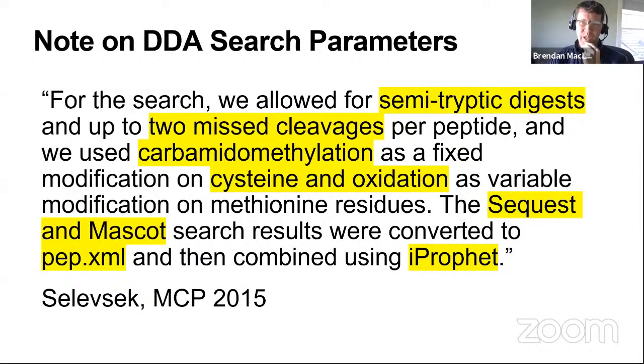So they're looking for things that have just a single tryptic end, and the search space is much larger. But one of the co-authors, Ludovic Gillet, who I talked to, was pretty adamant that they get 20% more peptide spectrum matches, and he believes that they're real.